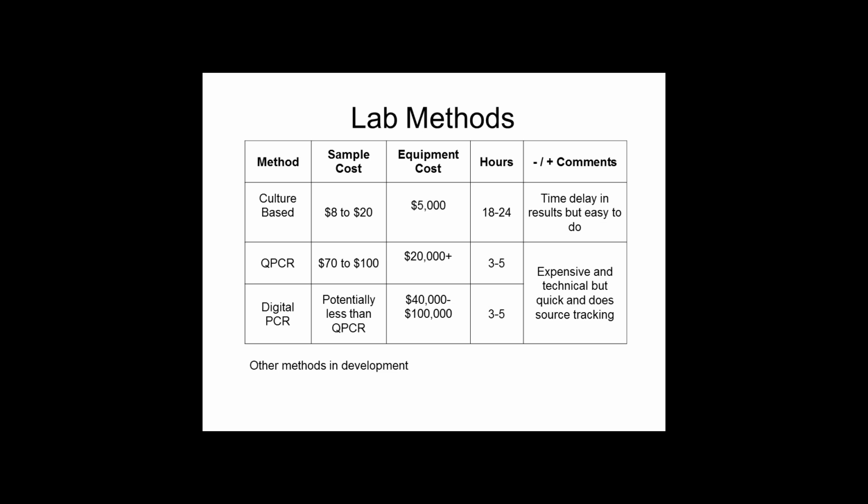So the other thing that is on the horizon, some people are starting to use this out in California and also for the Asian carp. What we're looking for is measuring the DNA of these invasive species or the fecal indicator bacteria, Enterococcus or E. coli, or even some of the pathogens. So you're measuring DNA again.